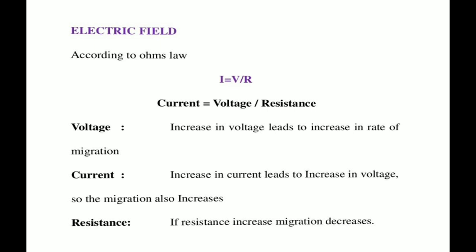The resistance of an electrophoresis unit depends on its size, the gel thickness, the amount of buffer used, buffer conductivity and temperature. This resistance normally decreases over time with an increase in temperature, and the amount of resistance determines whether the circuit is a good conductor.